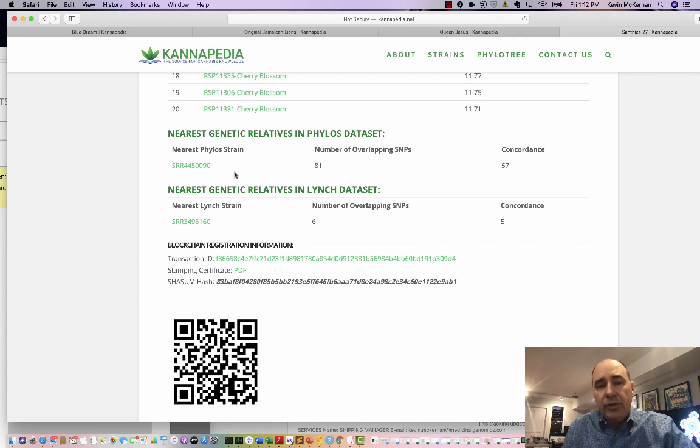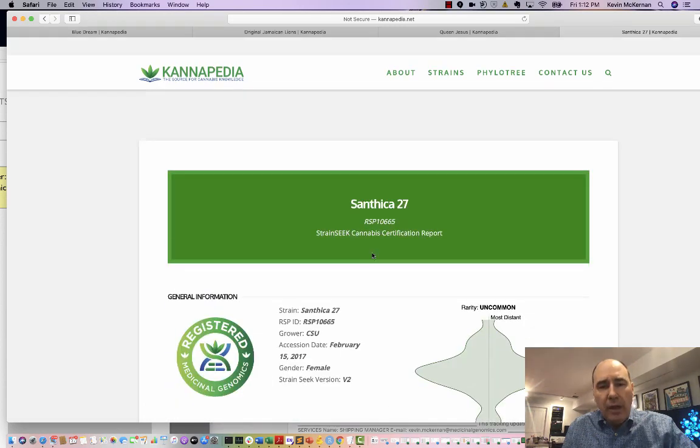The techniques that were used here predated people understanding that there's a SNP every 50 bases in cannabis, and so they used techniques that would trip up on those other variants and not always amplify targets out of the genome accurately. So we don't expect to get 100% overlap and concordance with these other techniques because they were operating with earlier tools.